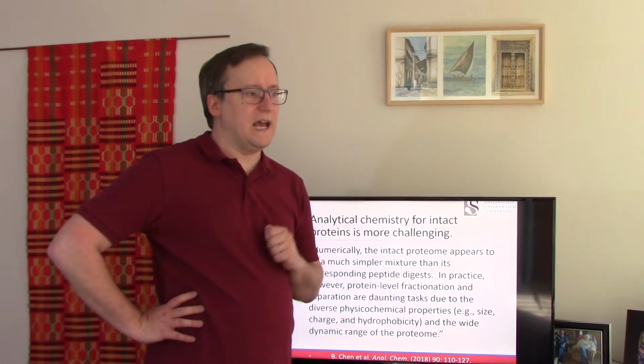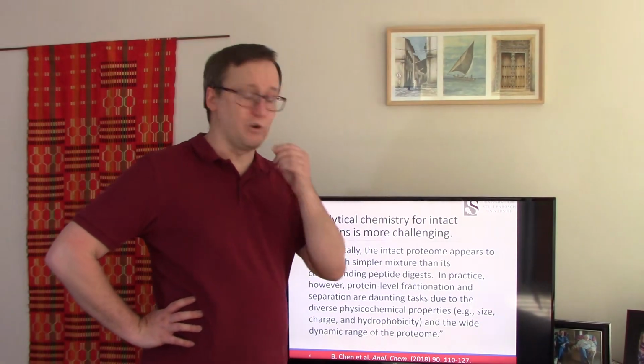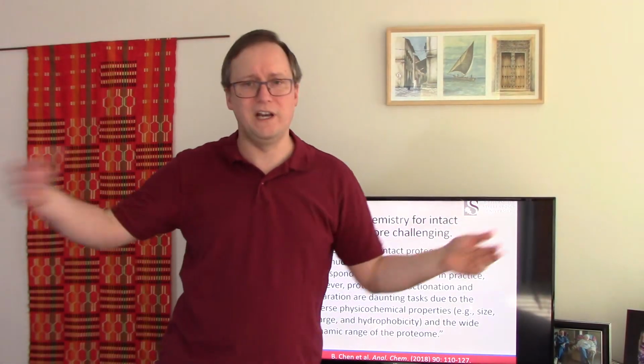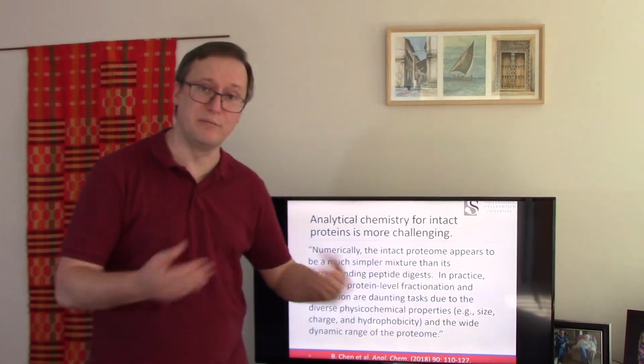So if you are looking at a protein that sits mostly within a transmembrane region, you're going to find that the hydrophobicity of that is quite extreme compared to a protein that wiggles about wild and free in solution. One is very polar, one is very hydrophobic. If you're trying to create an analytical chemistry approach for separating these uniformly, you're going to find that it's probably catered to in-solution proteins or to membrane proteins. That's a problem. So that's an example of a hydrophobicity difference.